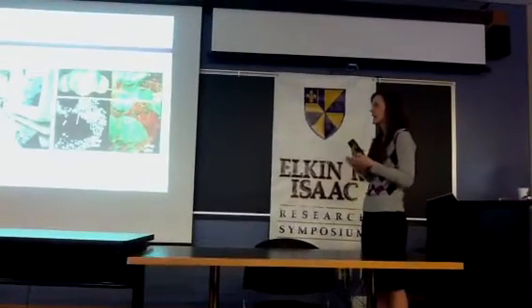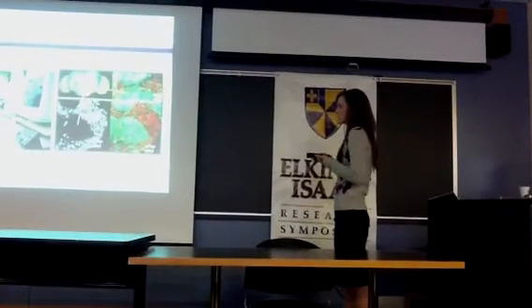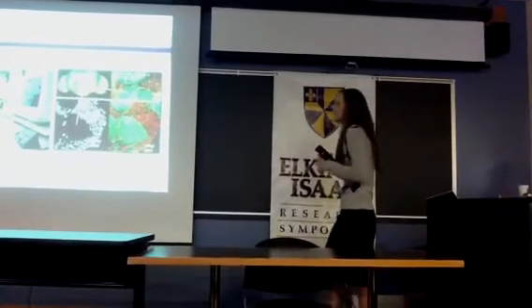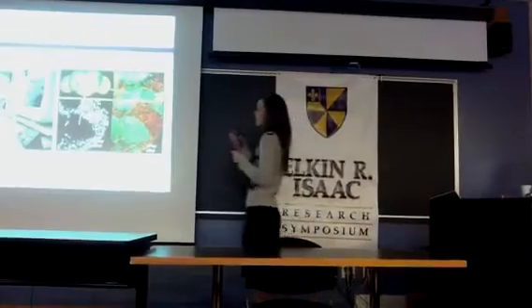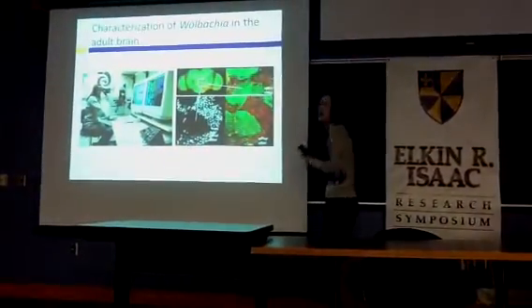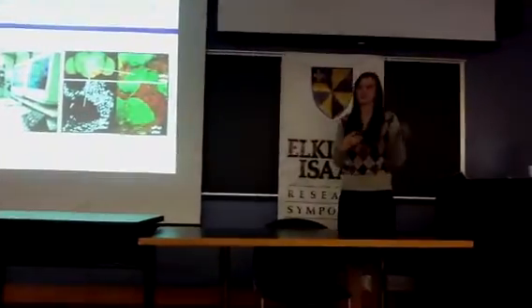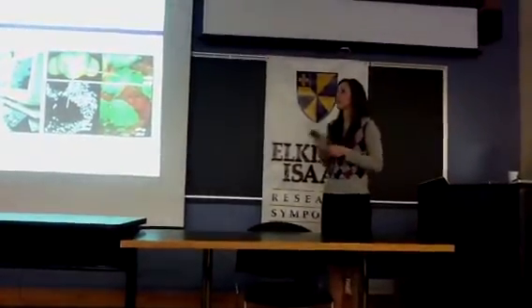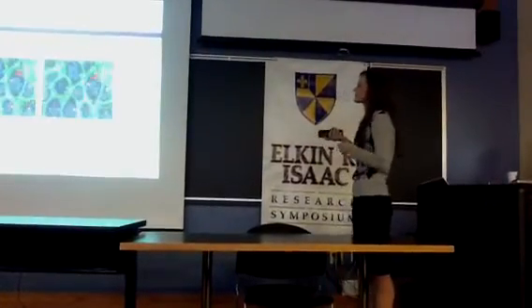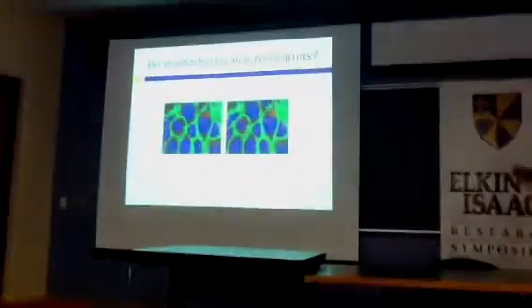And after doing this, I took images of the brains using a confocal microscope, which is pictured at the left. And this antibody staining is what labels the brain these different colors, in this case green and red. And this is important because it allows us to differentiate between the brain structures and between the different DNA found in the host brain.